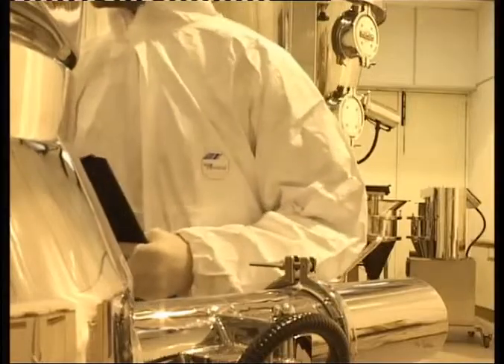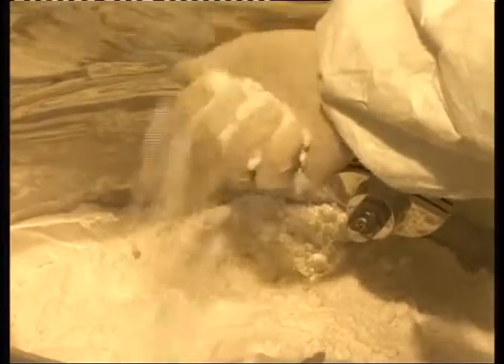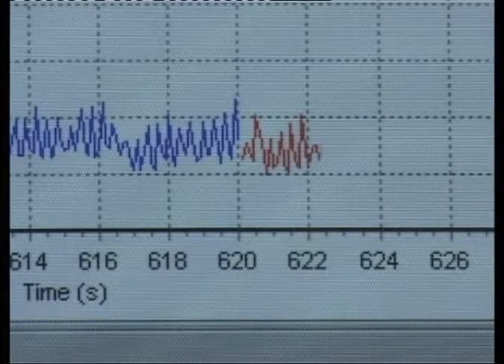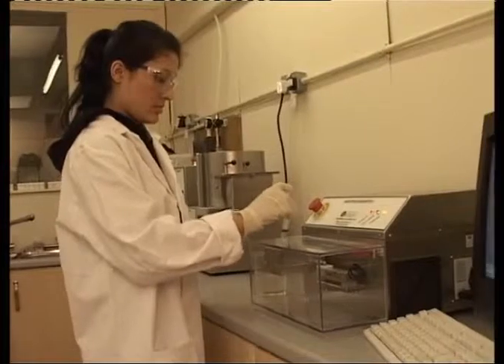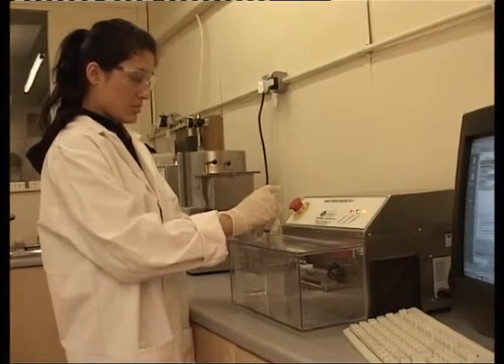Mixing time is a critical parameter in the granulation process, particularly when processing with high shear granulators. The MTR may be used to examine the role of various material parameters in order to assess their influence on the required granulation endpoint. The relative proportion of liquid binder added to the dry powder may also be varied in order to obtain the strongest granule. Changes in liquid binder content will affect the mixing time required to distribute the binder effectively.